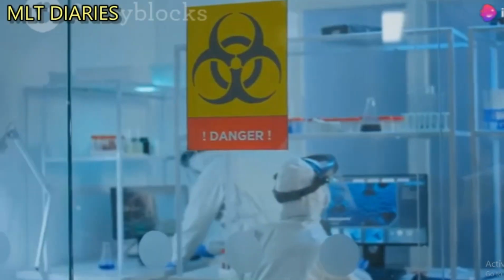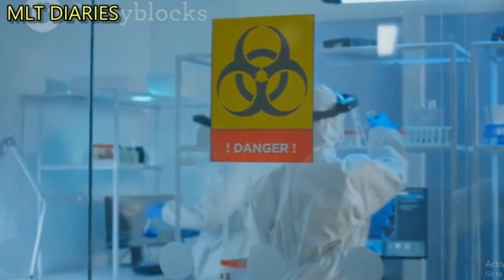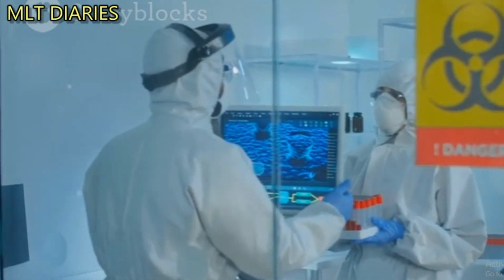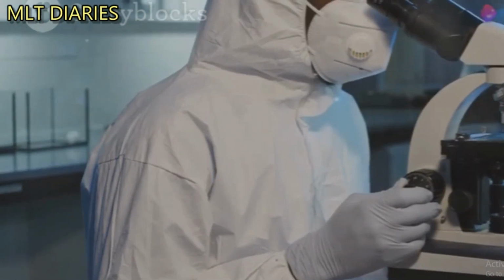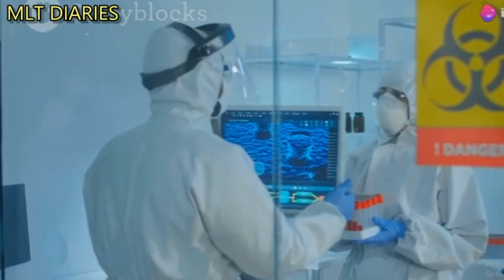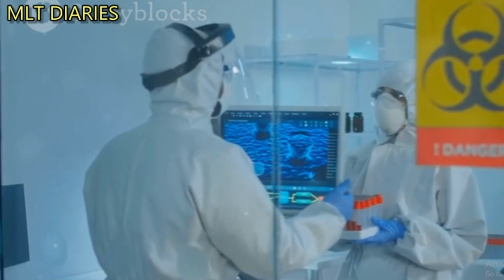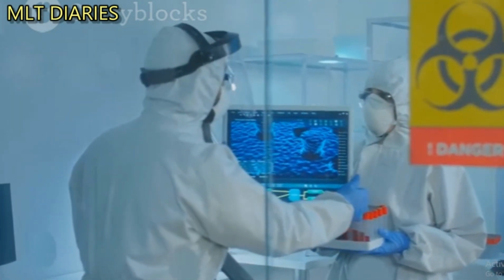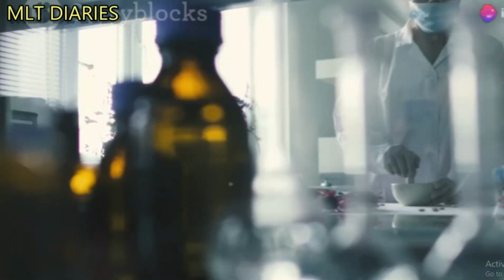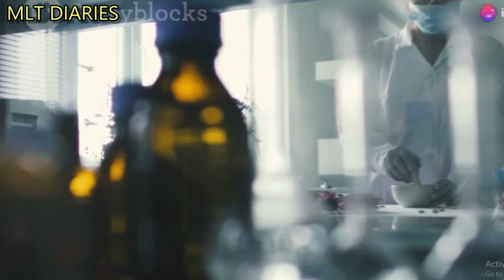To get started, you need to understand the structure of the manual. First, there's the introduction. It gives you a solid overview of biosafety principles. Then, we have the risk assessment section. This guides you on identifying and assessing risks tied to your lab work. Next up, biosafety levels, ranging from BSL-1 to BSL-4, each with specific requirements for safe handling. Don't forget the standard operating procedures, or SOPs, which detail how to safely handle biological materials.